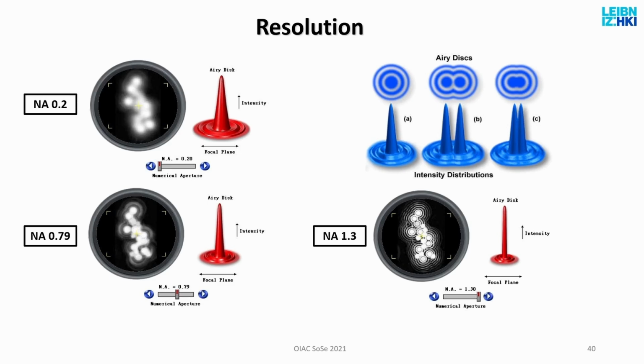If there's only one such object, and it's smaller than the resolution, by itself, I still know where it is exactly. But that means that I cannot have a second one next to it. But this is a principle behind one of the super resolution techniques, that I make sure that my molecules, which are smaller than the resolution, I only flash one molecule at a time in a certain radius. I never have two of them close to each other.